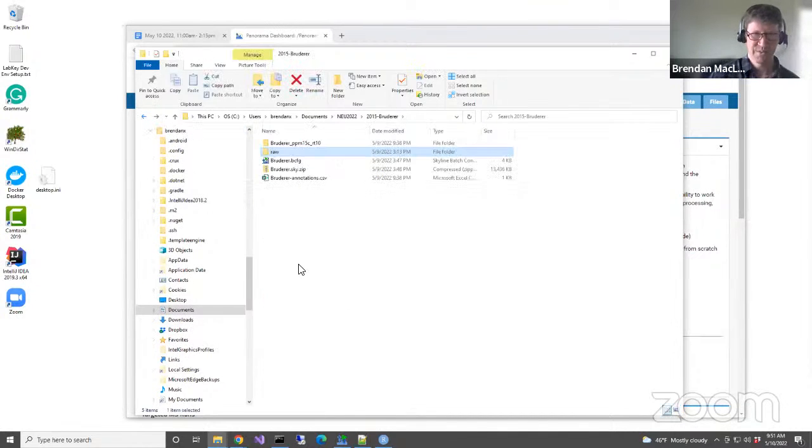That's what we hoped everybody could get through. Again, on a completely separate machine in my house with slower networking, I did manage to get through the full processing last night with MS Stats and everything. So I know that it's possible. With this, there are some extra files from that folder that we still need.